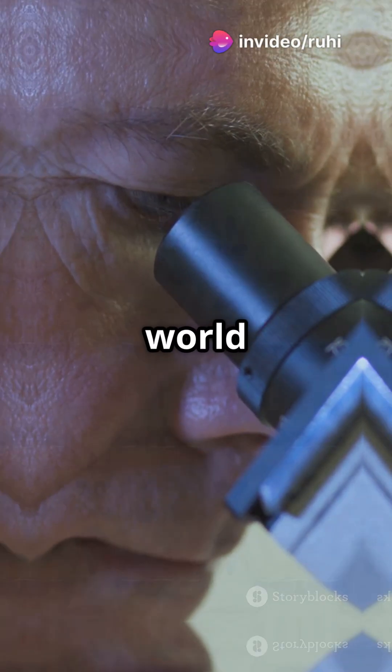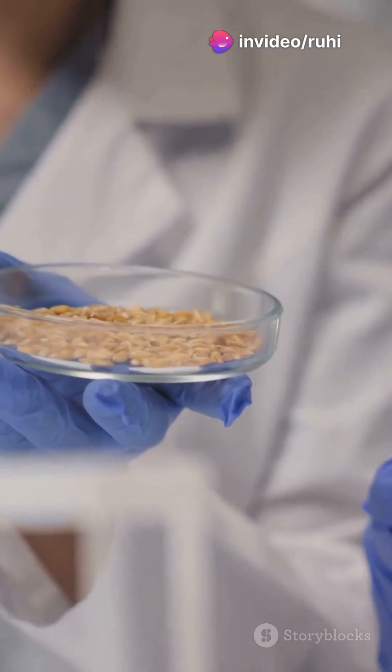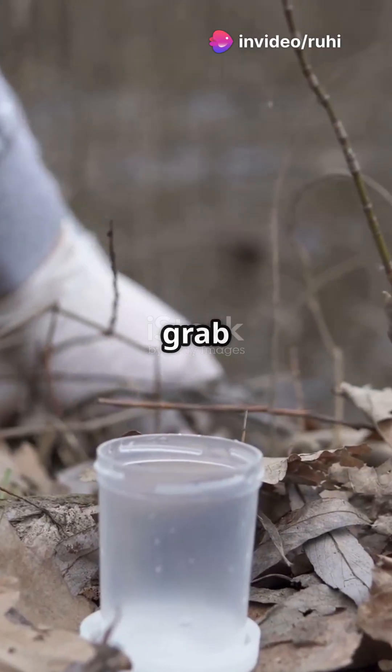Ready to dive into the microscopic world of soil bacteria? We've got you covered. First things first, grab your soil sample.